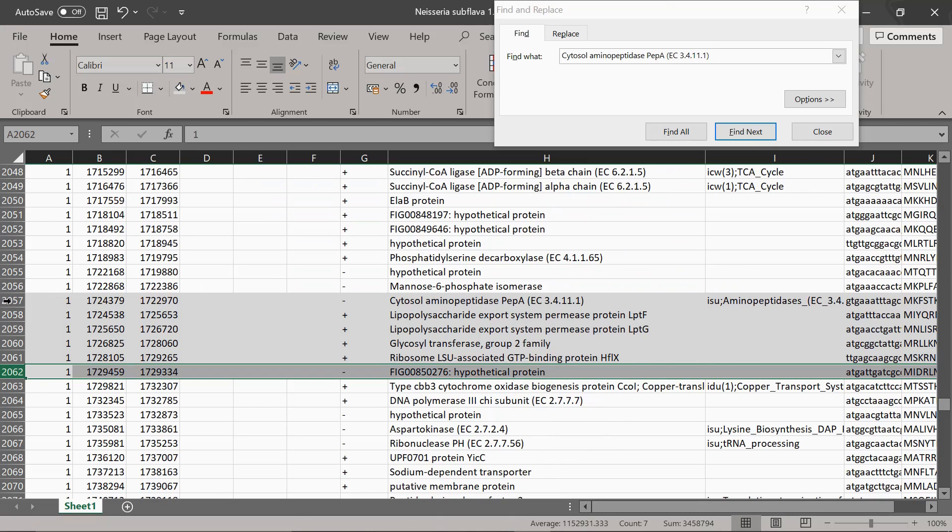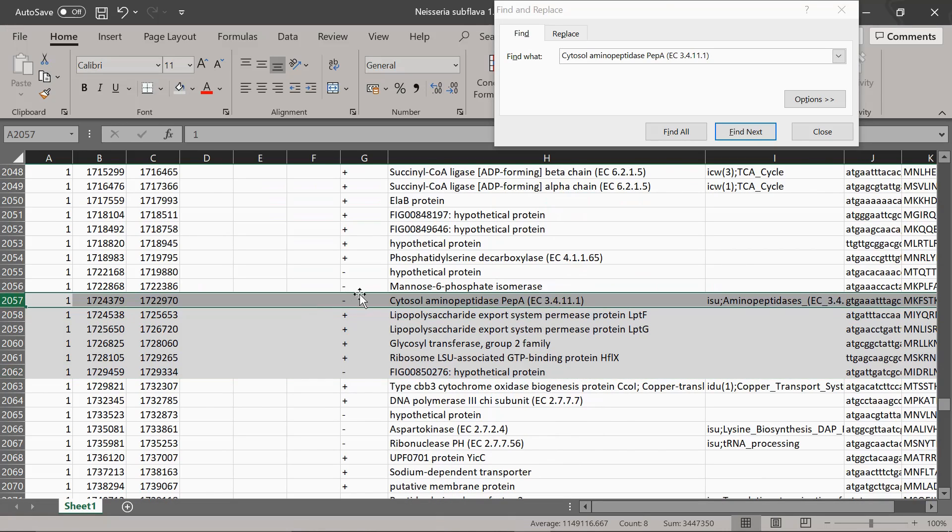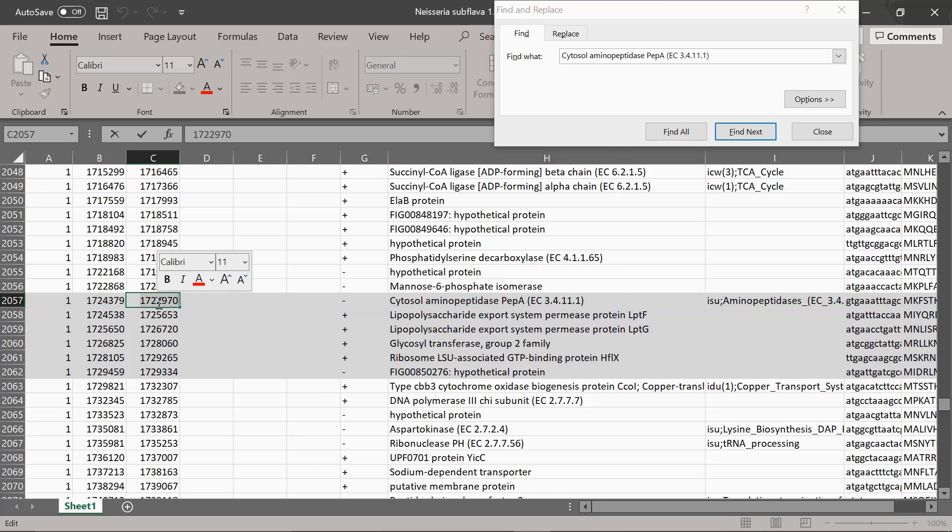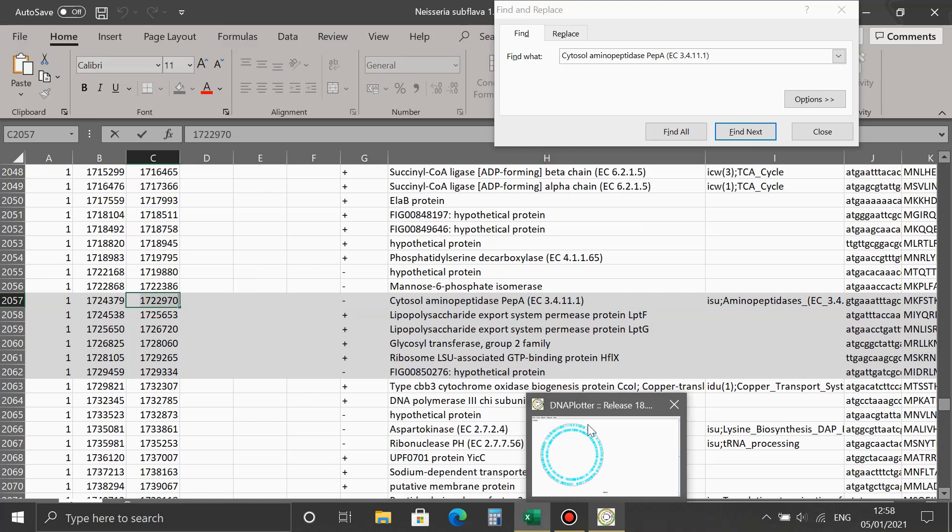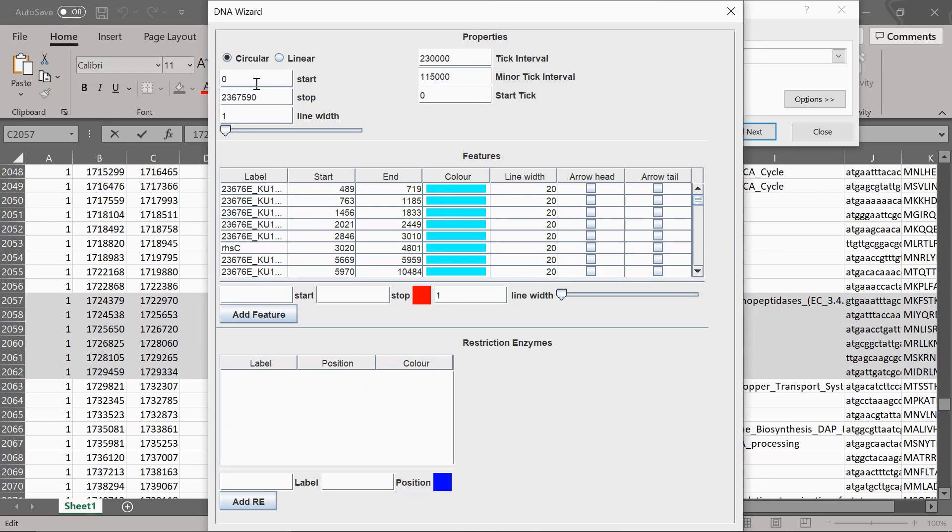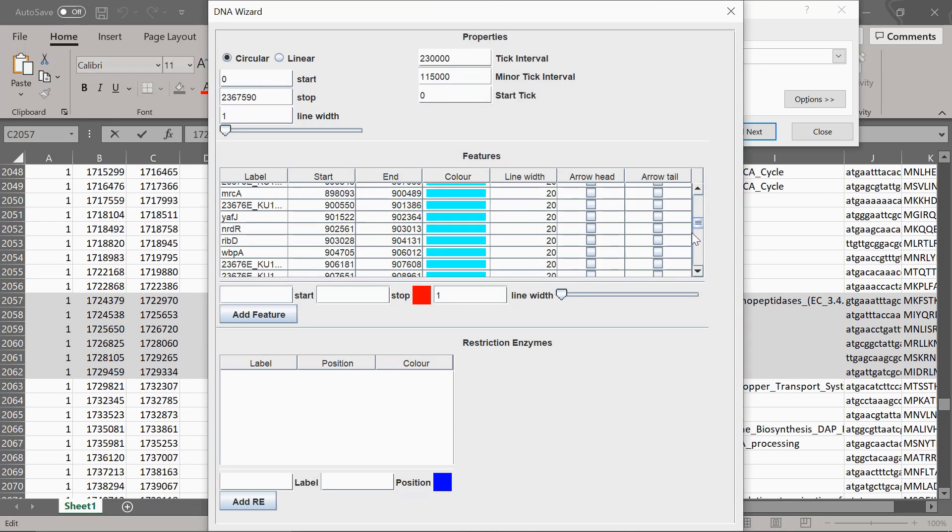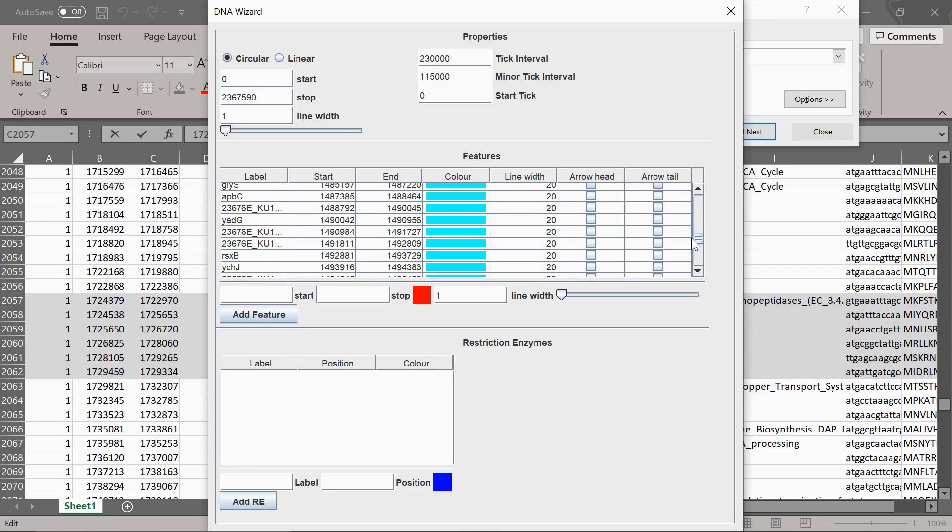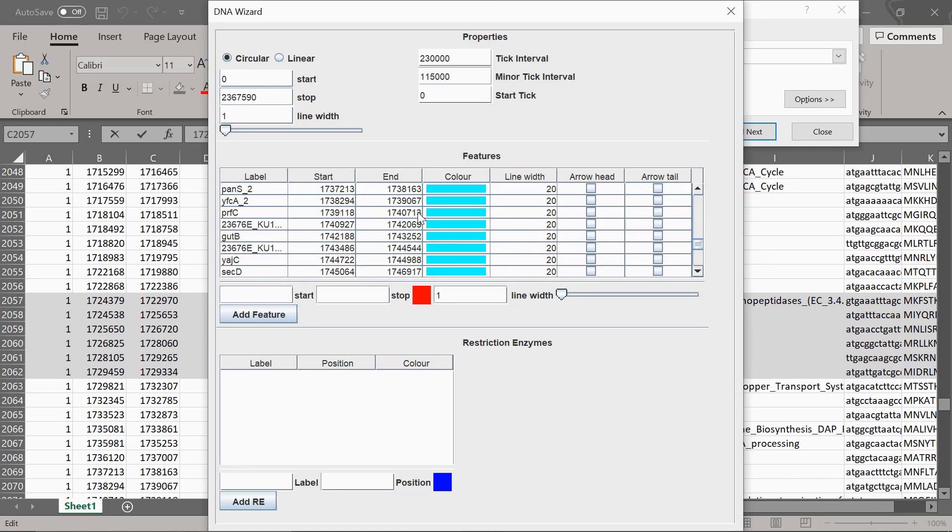It's on the minus strand. So you've got coordinates here, 1724379, 1722970. We'll start with this here. If you copy that value there, go into Artemis, you want to find out where that is in this list here. If you look down the list, here it is here, PEP A.